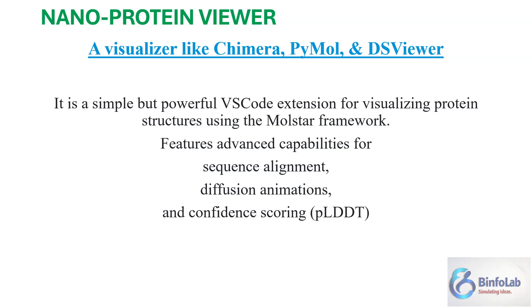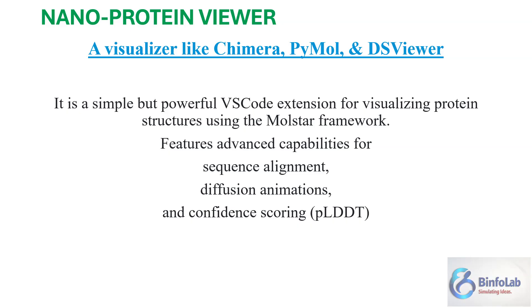It is using the framework of Molstar and is capable of molecular sequence alignment, showing diffusion animations, and also takes account of the confidence scores generated by many programs and servers like PLDDT.